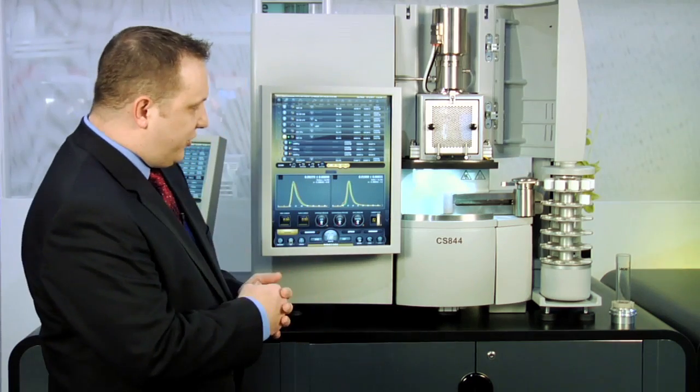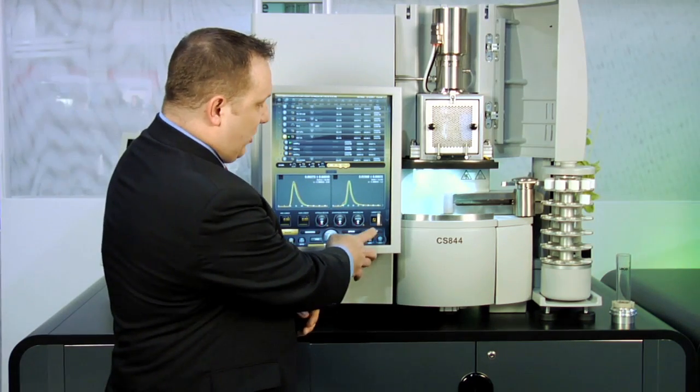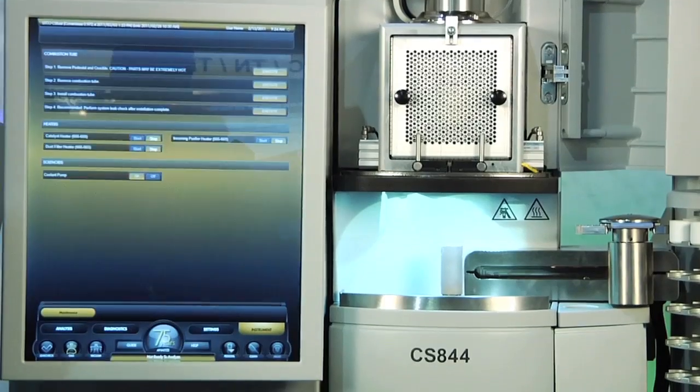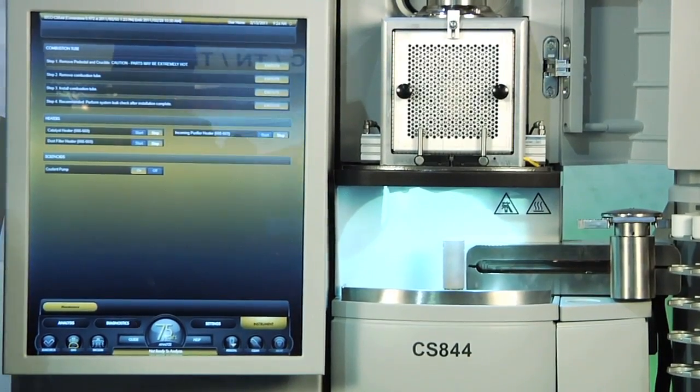I'm going to go into the instrument software and enter into a maintenance section. This is going to give me four prompts. The first of which would be to remove the pedestal and crucible if present.